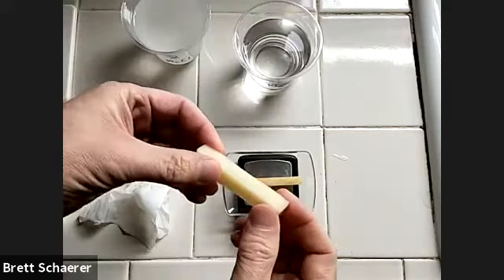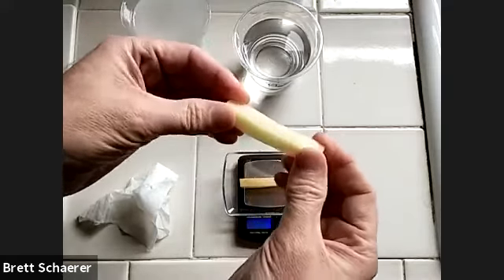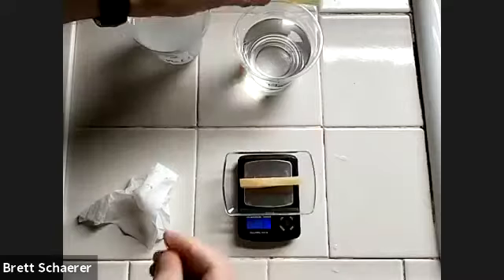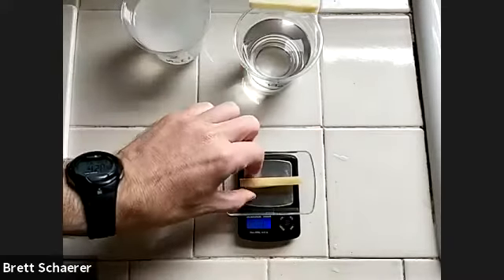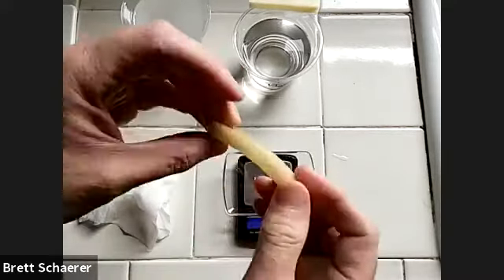And one thing I'll notice is that the water piece is much more turgid. It's holding its shape a lot better than it did when it started. And the saltwater piece is much less turgid. So it's kind of floppy, actually.